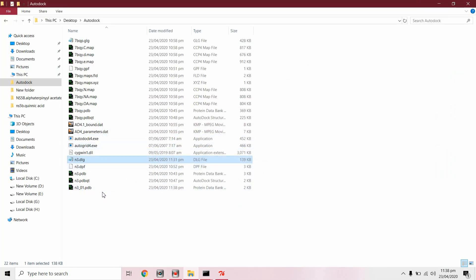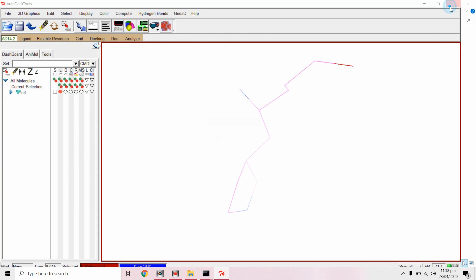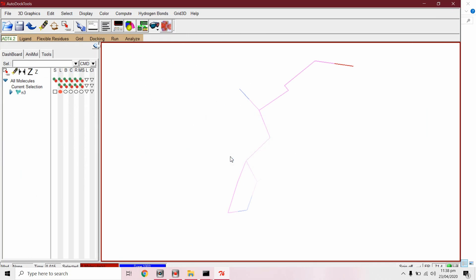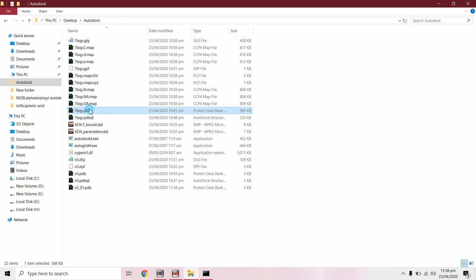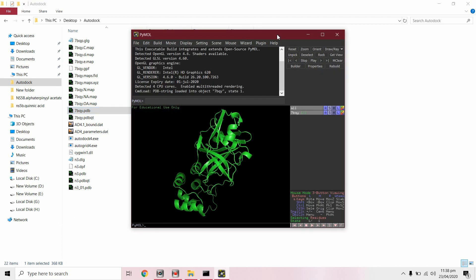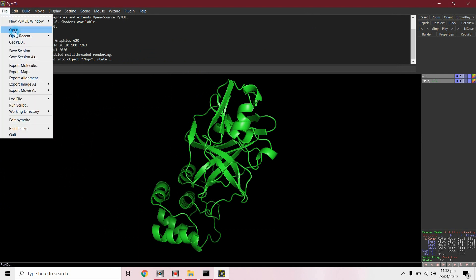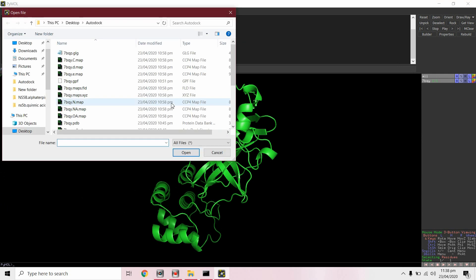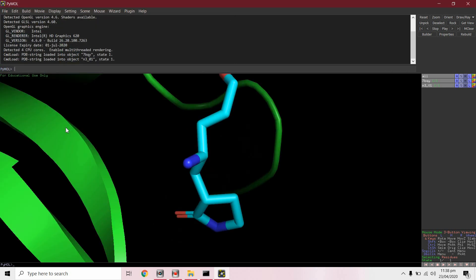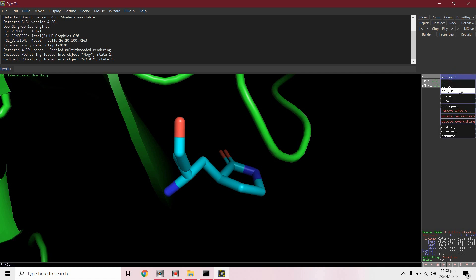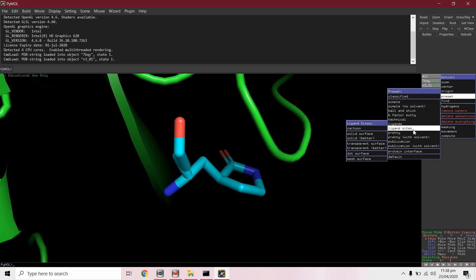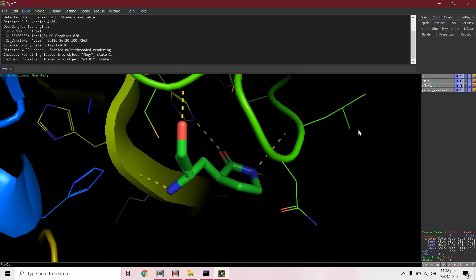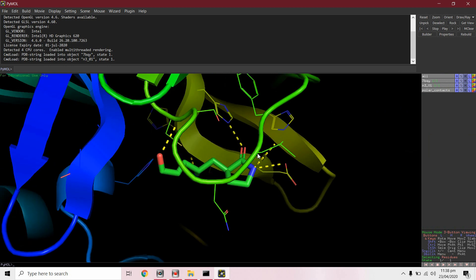Here we have this PDB file. We can analyze our results by PyMOL, just need to convert in a dot PDB file. Open our protein, this is primary protein. From file open, open this one. Here we go from reset, ligand sides cartoon. This will show the interaction with the protein.